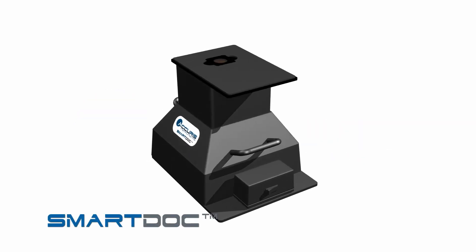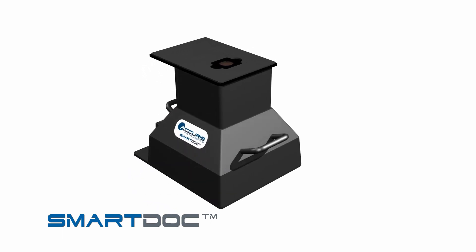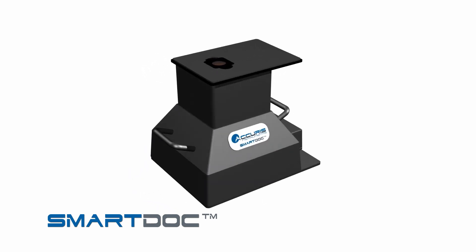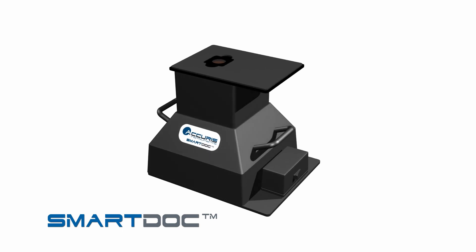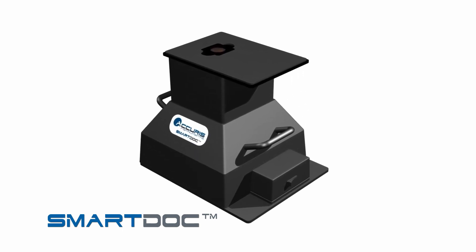Introducing the SmartDoc 2.0 Gel Visualization and Imaging System. This innovative system allows you to view your stained gels, cut out DNA bands, and take pictures of your gels simply by using your smartphone camera.